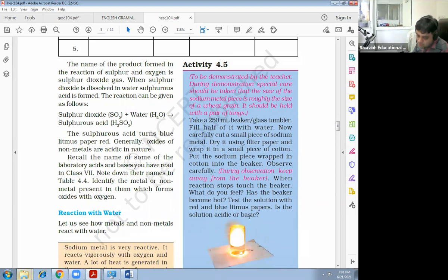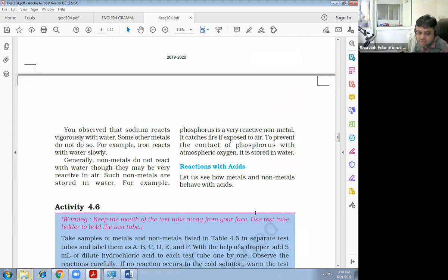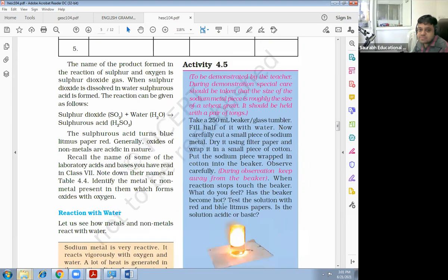Has the beaker become hot? Test the solution with red and blue litmus paper. Is the solution acidic or basic? Let's check it. Activity 4.5.